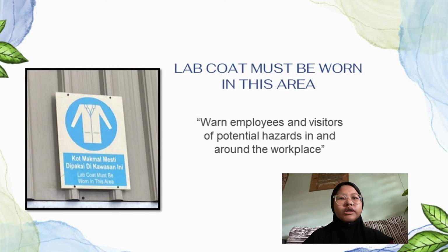When properly used, a lab coat provides protection of skin and personal clothing from incidental contact and small splashing. Number 2 is prevent the spread of contamination outside of the lab. Number 3 is provide a removable barrier in the event of an incident involving a spill or splash of hazardous substance.